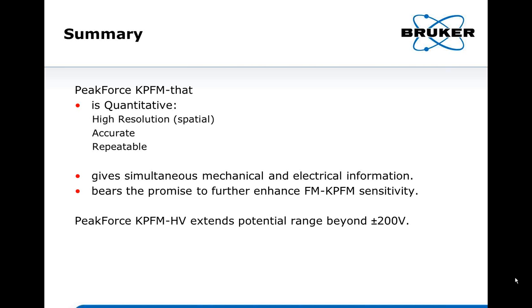In PeakForce KPFM, or in general for FM-KPFM detection, frequency shift is measured basically through a phase measurement. The person asks, is that phase measurement of the fundamental resonance or some other higher resonance mode? For the frequency modulation, we are using the fundamental resonance, and that turned out to be more sensitive, more accurate.